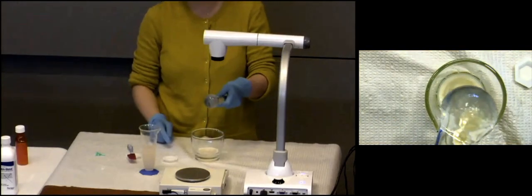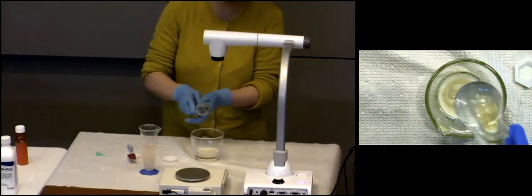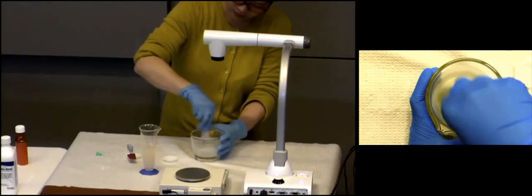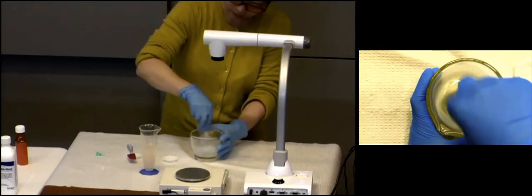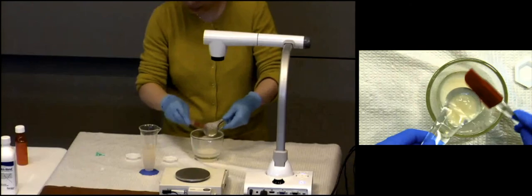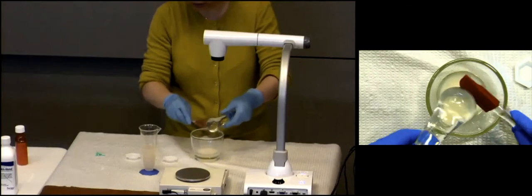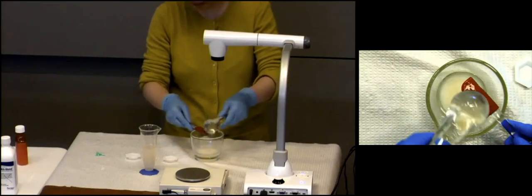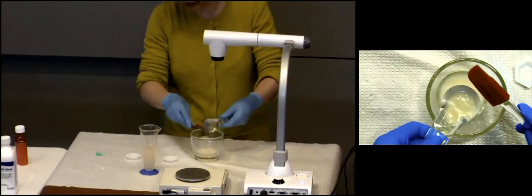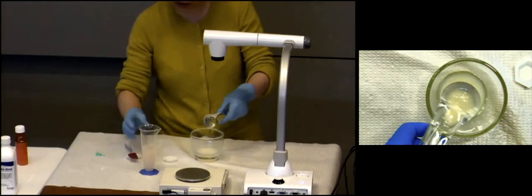Did you see that? Have I ever set my pestle somewhere on the bench? No, so always hold on to it using your non-dominant hand when you don't need it. There will be a lot stuck to the pestle in the beginning, when it's a real thick, sludgy paste. But as it begins to thin out, it will pull all of that stuff off the pestle. So you don't want to leave it on the countertop or somewhere else. Not only can your rubber spatula help you do the scraping, your pestle can come back to scrape something off your rubber spatula as well. Especially since you will have more drug than I do, and you probably will have a lot of drug stuck on the rubber spatula, they can help each other and rinse each other.